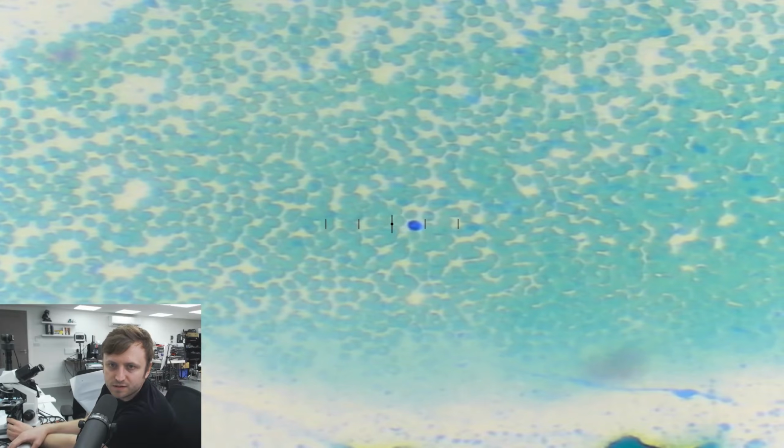But one of the reasons for wanting to do this is it means that I can now do actual medical tracking, in the way of I can see whether my blood is suddenly flushed with immature cells, which could be like a cancer sign. I could see if my lymphocytes are weirdly formed. That could be another cancer sign.